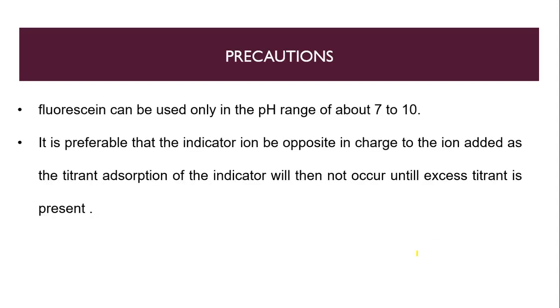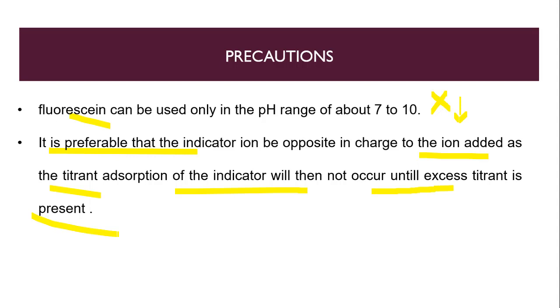Which precautions should we take when performing the Fajan's method? Fluorescein can be used only in the pH range of 7 to 10, because if we use it below pH 7 there will be no color change, due to the acid constant of fluorescein. It is preferable that the indicator ion be opposite in charge to the ion added as the titrant, so that adsorption of the indicator will not occur until excess titrant is present.